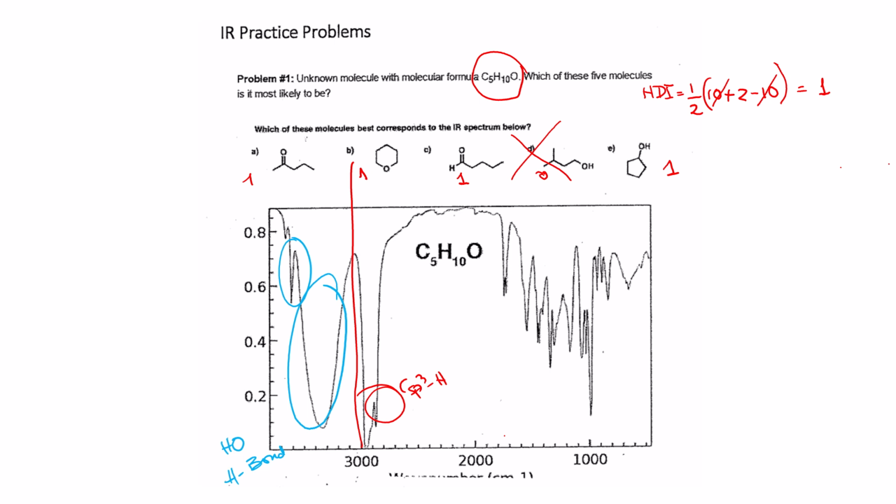And remember, of course, we have oxygen in the molecule. We cannot suggest an OH if we didn't have one. So this one is free, so no hydrogen bonding. In a more diluted solution, you will see that. And this is broad, so is that.